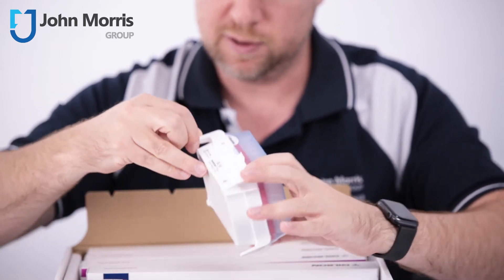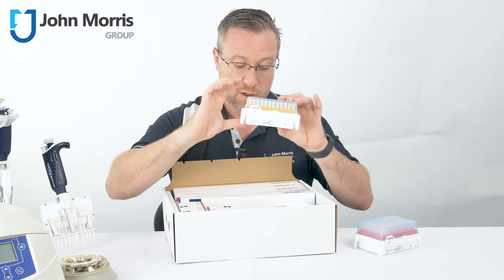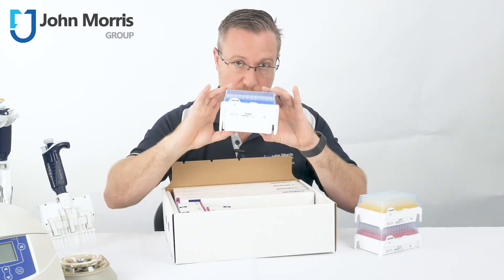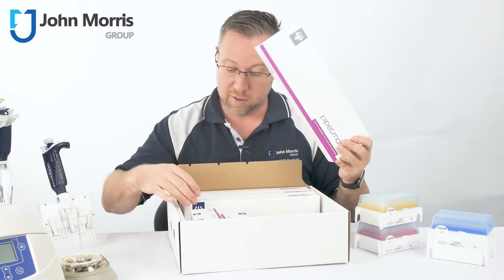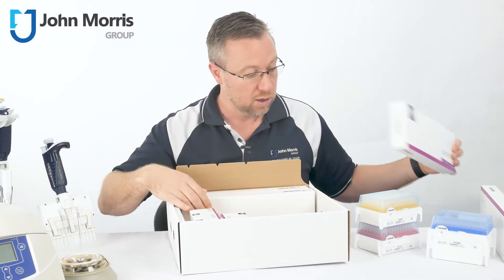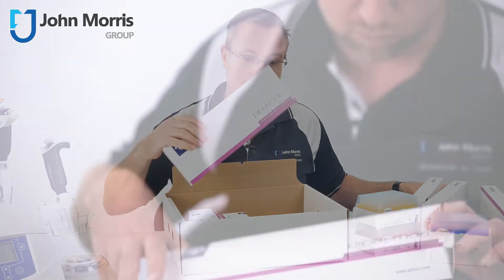You get three boxes of tips: DL10, D200, and D1000. And of course you get the four pipettes — the 2, 20, 200, and 1000 microliter pipettes.